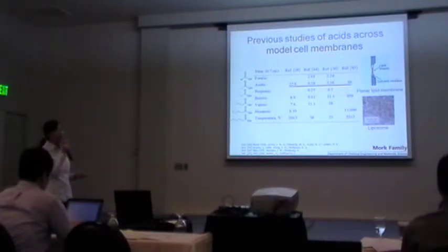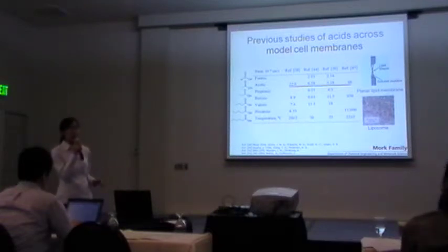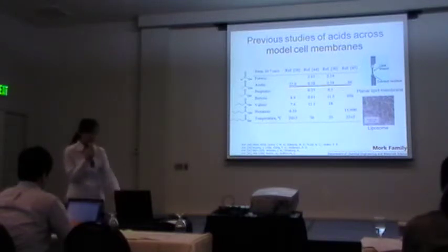And the liposome is a solvent-free lipid membrane, which has properties more like the true cell membrane. But as you can see, the polydispersity of the liposome will also bring artifacts to the permeation results. So a more accurate method needs to be developed to have a clear understanding of the mechanism of passive transport.